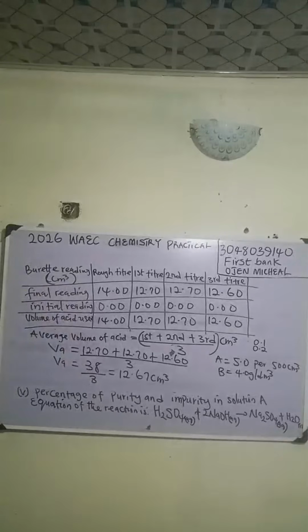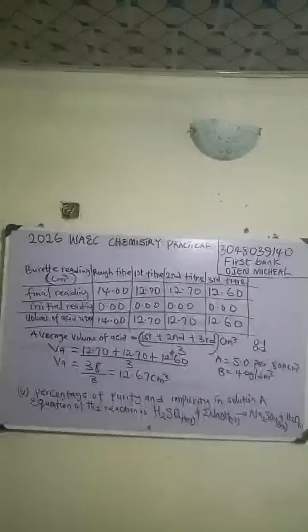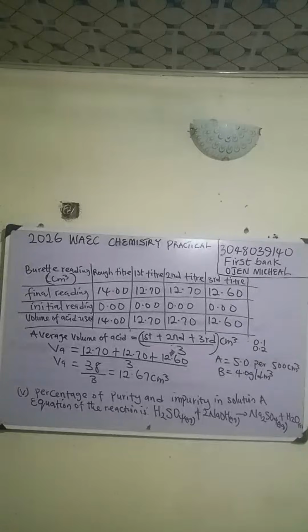Can the third titer value be greater than the second? No. The third titer should not be greater. That is why you have to be very, very careful.